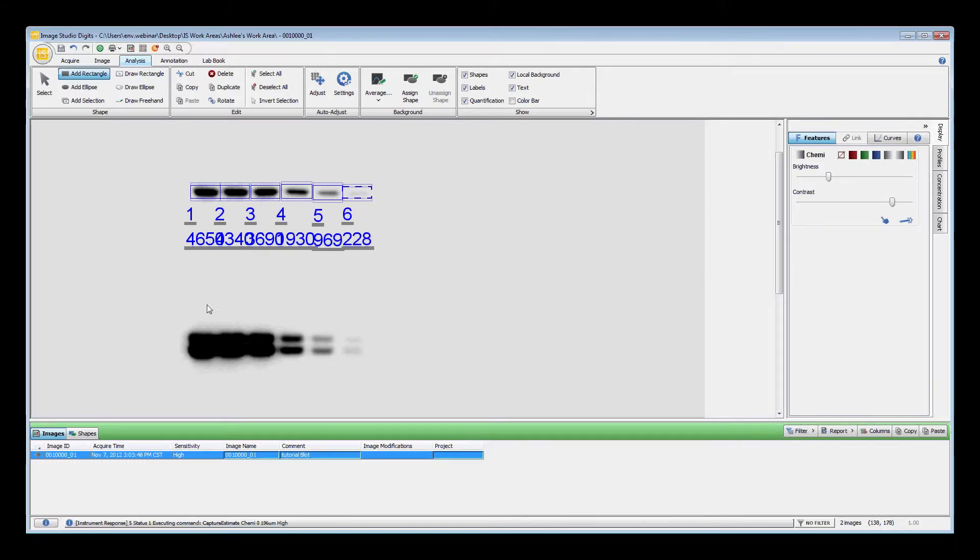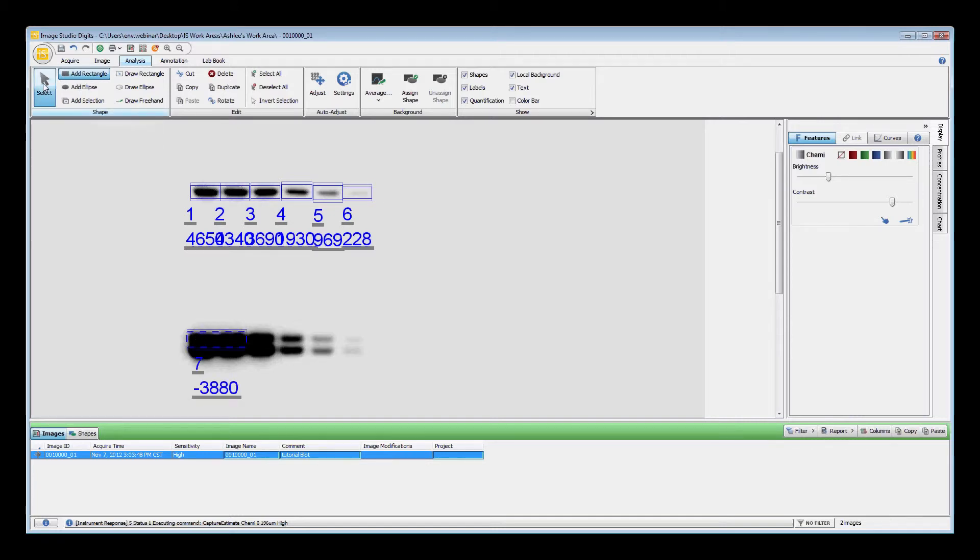However, if when you click, the software selects an area that is too large, you can resize the feature by clicking the Select button in the Analysis tab, then using the double arrow to manipulate the shape.